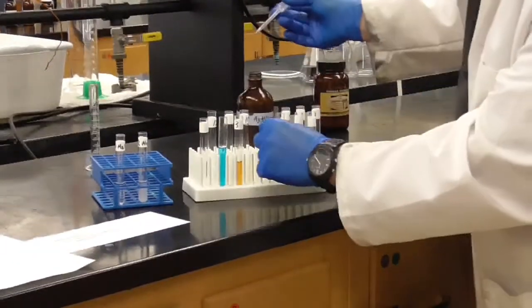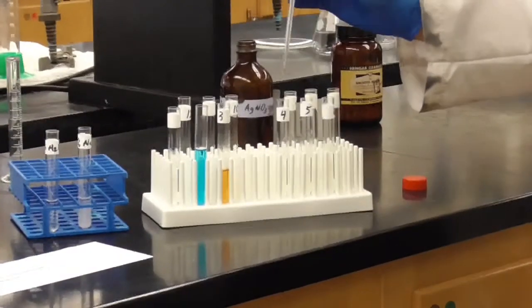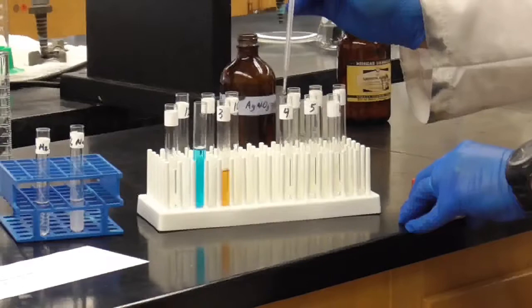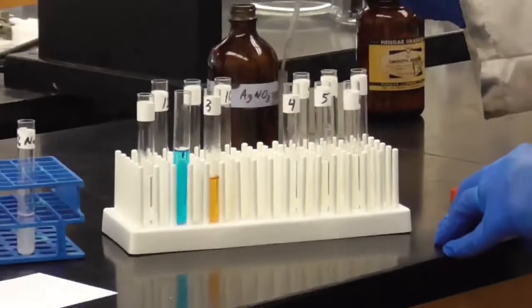All right, so turn this so you can see the numbers. That's 4, 5, and 6. All right, so here we go. You can watch right down there to see what happens as I drop the silver nitrate in. Here is 1 drop, 2 drops, 3 drops. I put 4 drops in, but that's fine.